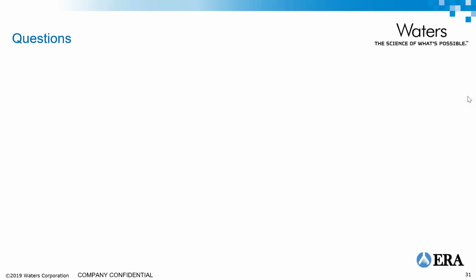All right. What happens if I don't pass? Well, generally you're going to have to demonstrate some type of corrective action. But that corrective action really can vary depending on who you're reporting the results to and what they require. I have seen corrective action be anything from you need to give some type of a written response to why the failure occurred. You may potentially need to run a QC sample and communicate your result from the QC sample to your accreditation body, or you may have to go down the road of actually participating in another study. It really just depends on what's required with your AB. We're going to have an option regardless of what you're required to do here, whether it's QC or another study or a quick response. Sometimes that may be an option, but any of those will be available through ERA.